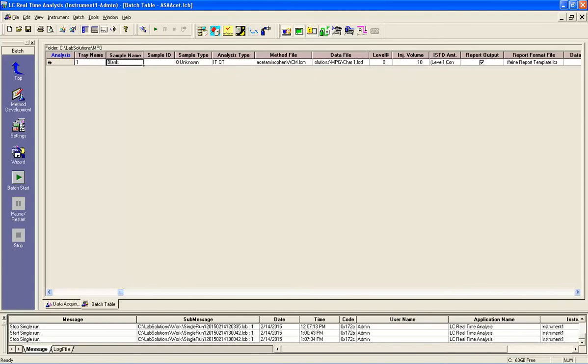So you should see at least line number 1 all the way across here, right? Okay, so tray name. Okay, that means it's tray number 1. But that's not really where the column starts. You've got to be careful. If you go down to the bottom and take a look at the toolbar, see this area here?